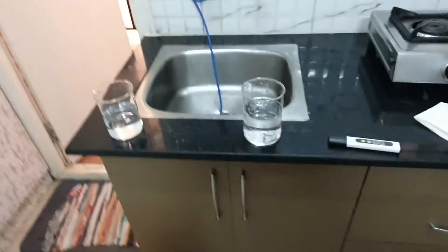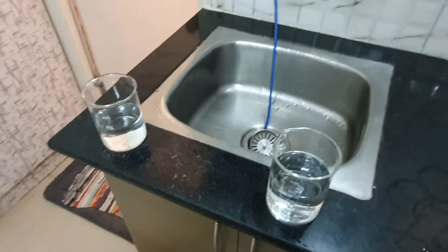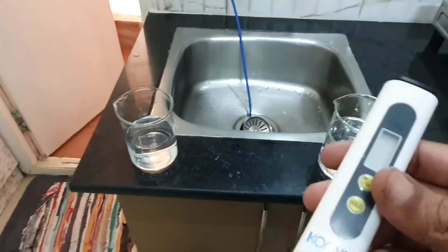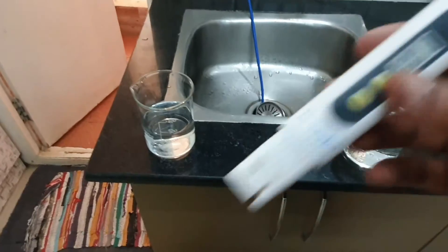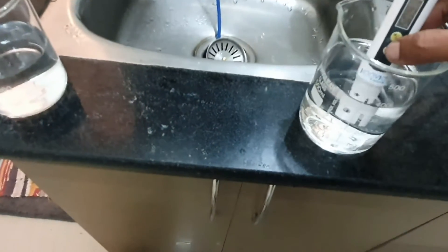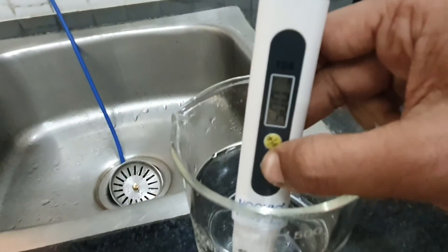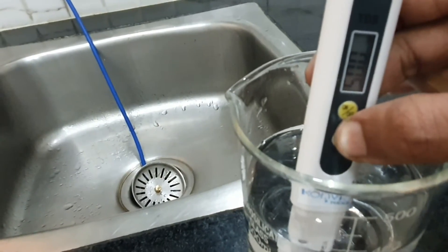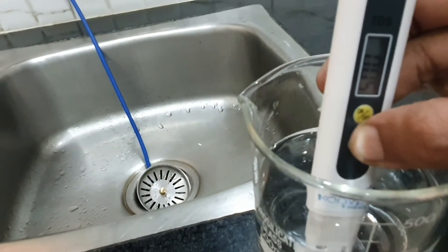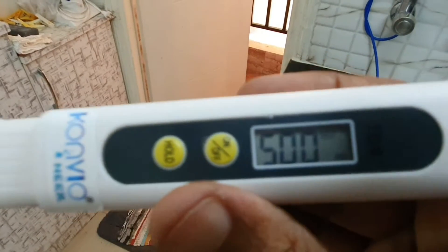The meter is pre-calibrated, so I'll just switch it on — it shows zero. I'm putting it into the tap water now. I have a reading of around 500 — let me hold that. So this tap water is around 500 PPM.